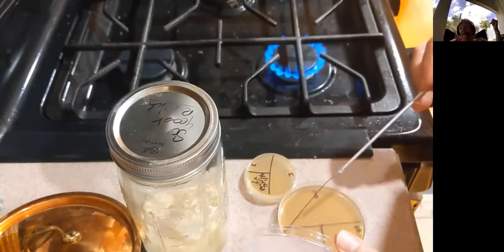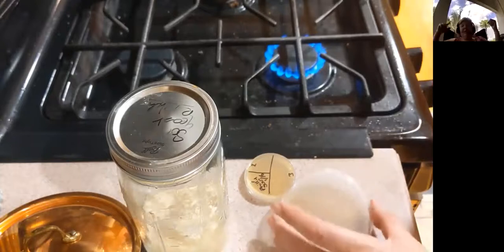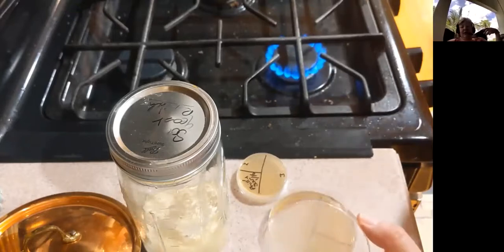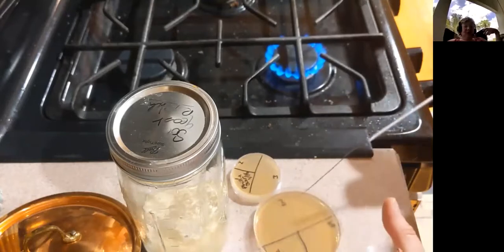I have no bacteria. And then I'm going to pick up those yeast again that I put on the plate, and I'm going to spread them out by moving back and forth. This spreads the yeast out and dilutes them. I'm now flaming my loop again, making it red hot, letting it cool, checking to make sure it's cool by putting it on a bit of the plate that has no bacteria on it or yeast.